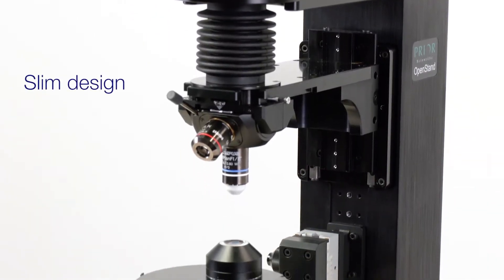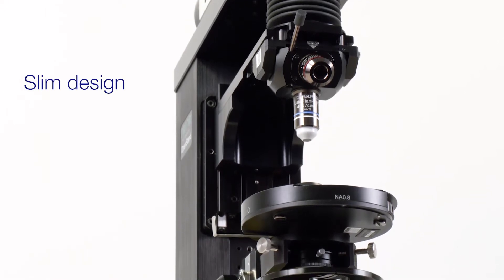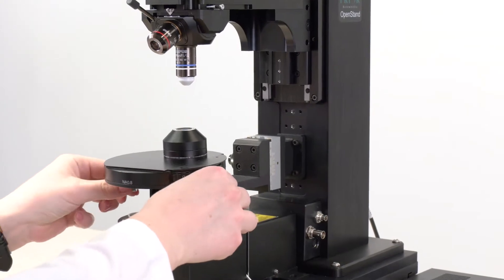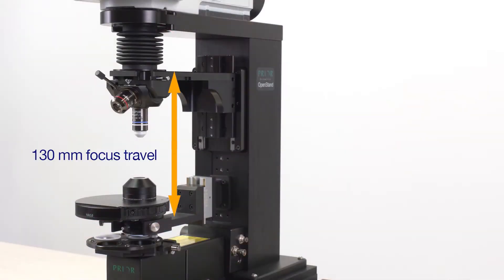The open stand microscope frame's slim design minimizes the restrictive workspaces and sample positioning of traditional microscope frames. Its large, 130 mm focus travel accommodates a wide variety of samples, from tissue sections to whole animals.